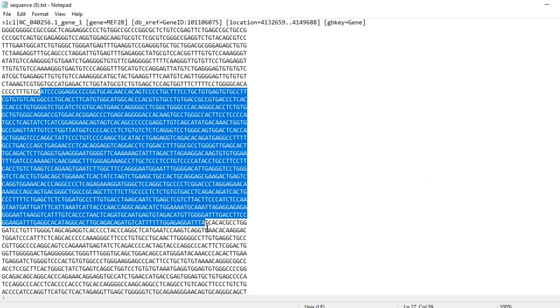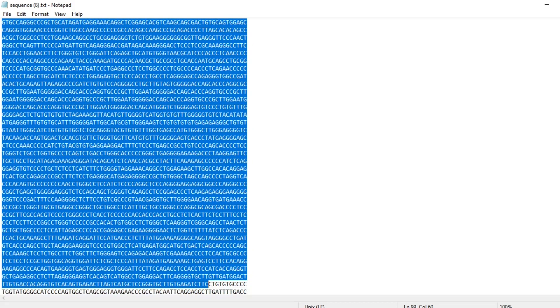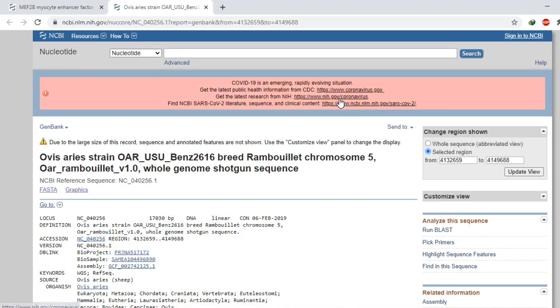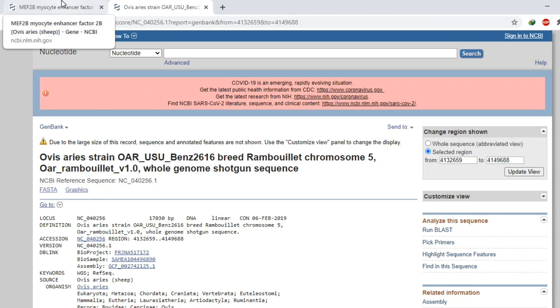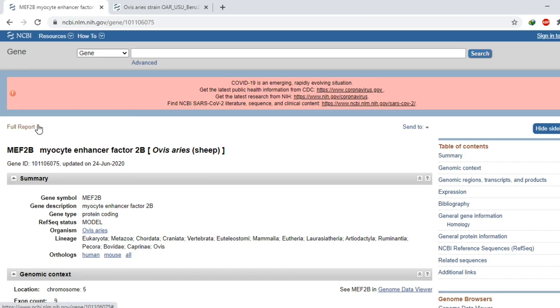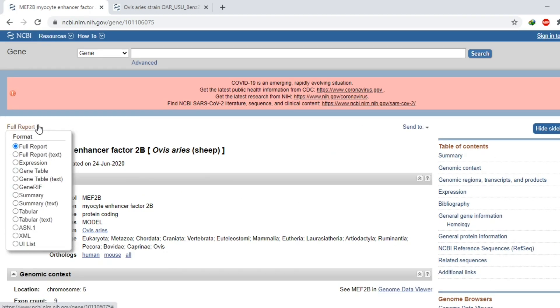We have the complete sequence of our gene, but we want to distinguish the exonic region and intronic region separately. So we will go to the previous tab and click on 'Full Report' to switch to the Gene Table view.